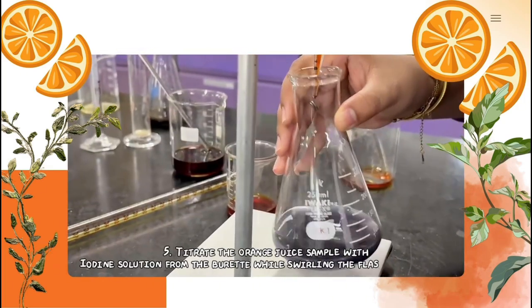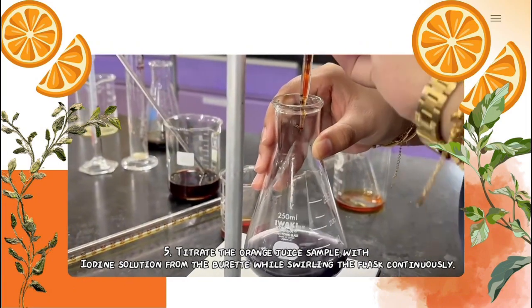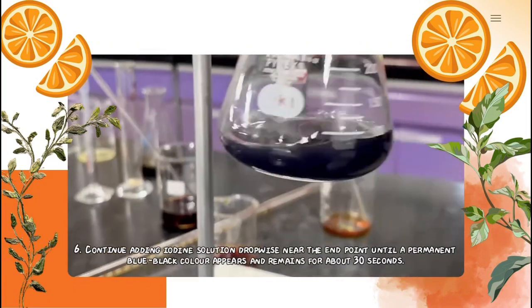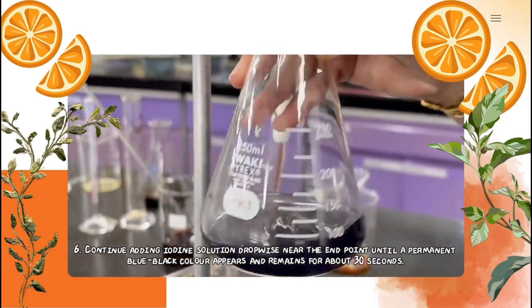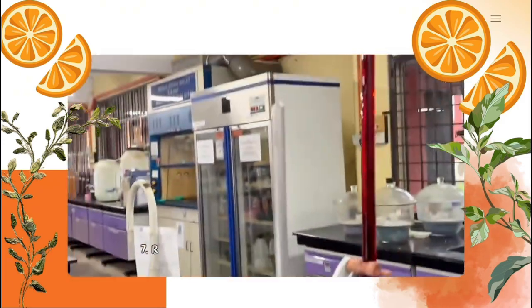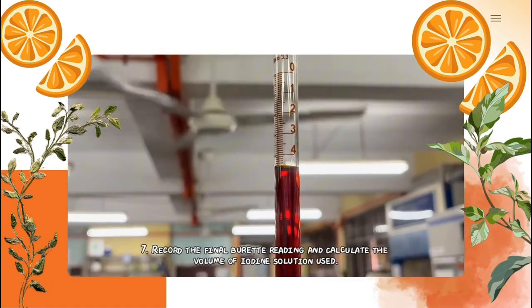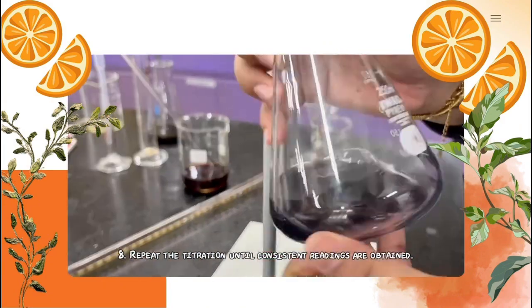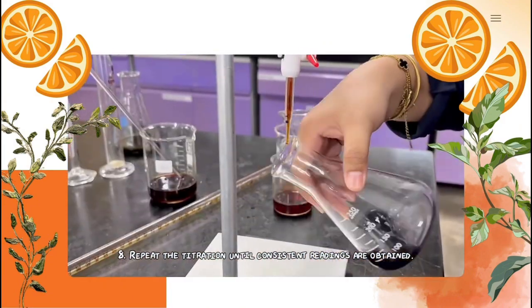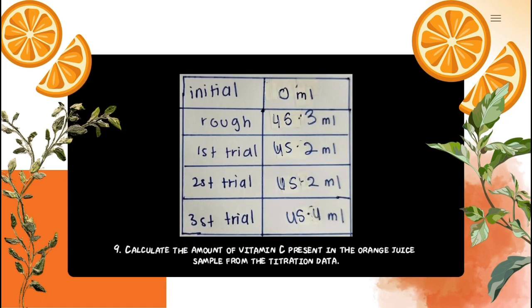Titrate the orange juice sample with iodine solution from the burette while swirling the flask continuously. Continue adding iodine solution dropwise near the end point until a permanent blue-black color appears and remains for about 30 seconds. Record the final burette reading and calculate the volume of iodine solution used. Repeat the titration until consistent readings are obtained. Calculate the amount of vitamin C present in orange juice sample from the titration data.